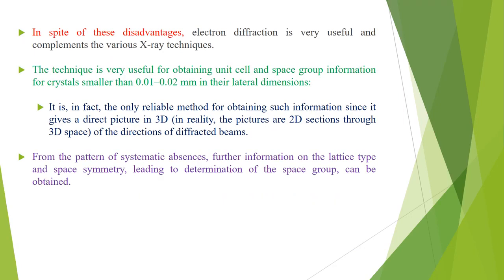So this lecture is also the continuation of the previous lecture, in which we have started the electron diffraction technique, and we have studied its basics, and also the principle of the electron diffraction technique, and we were discussing the advantages and disadvantages of electron diffraction technique. Here we will continue those disadvantages. In spite of these disadvantages, electron diffraction is very useful and complements the various X-ray techniques.